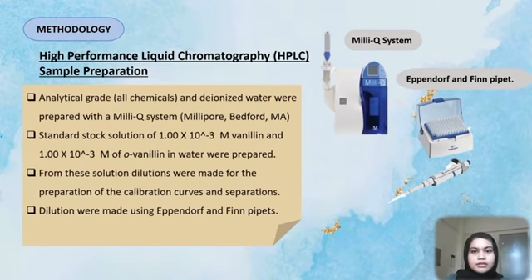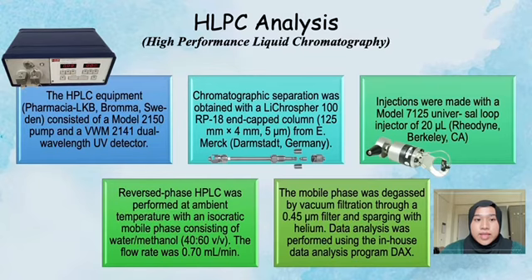Next will be INSYIRAH to continue with the HPLC analysis. Next, I will continue to explain the high-performance liquid chromatography analysis.